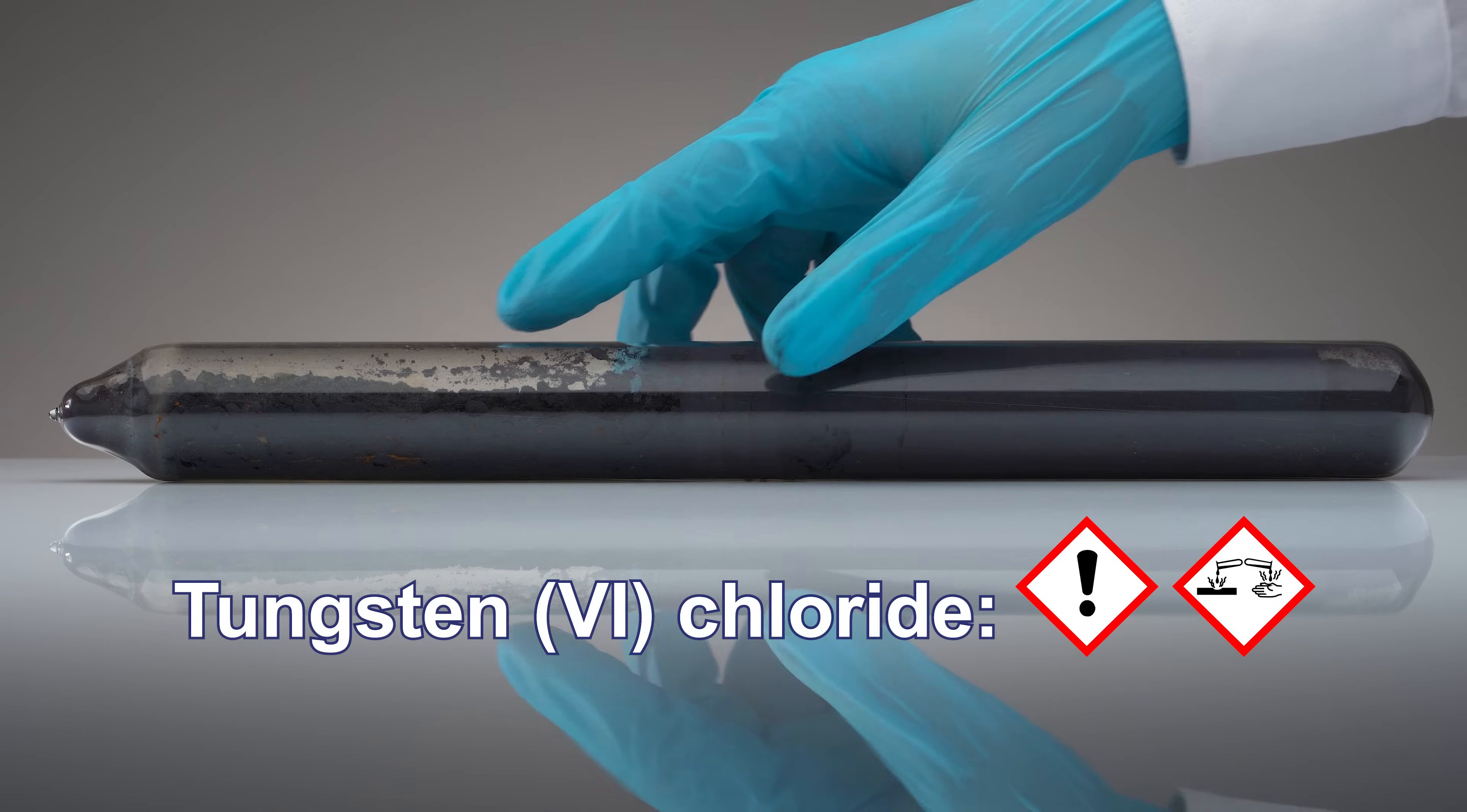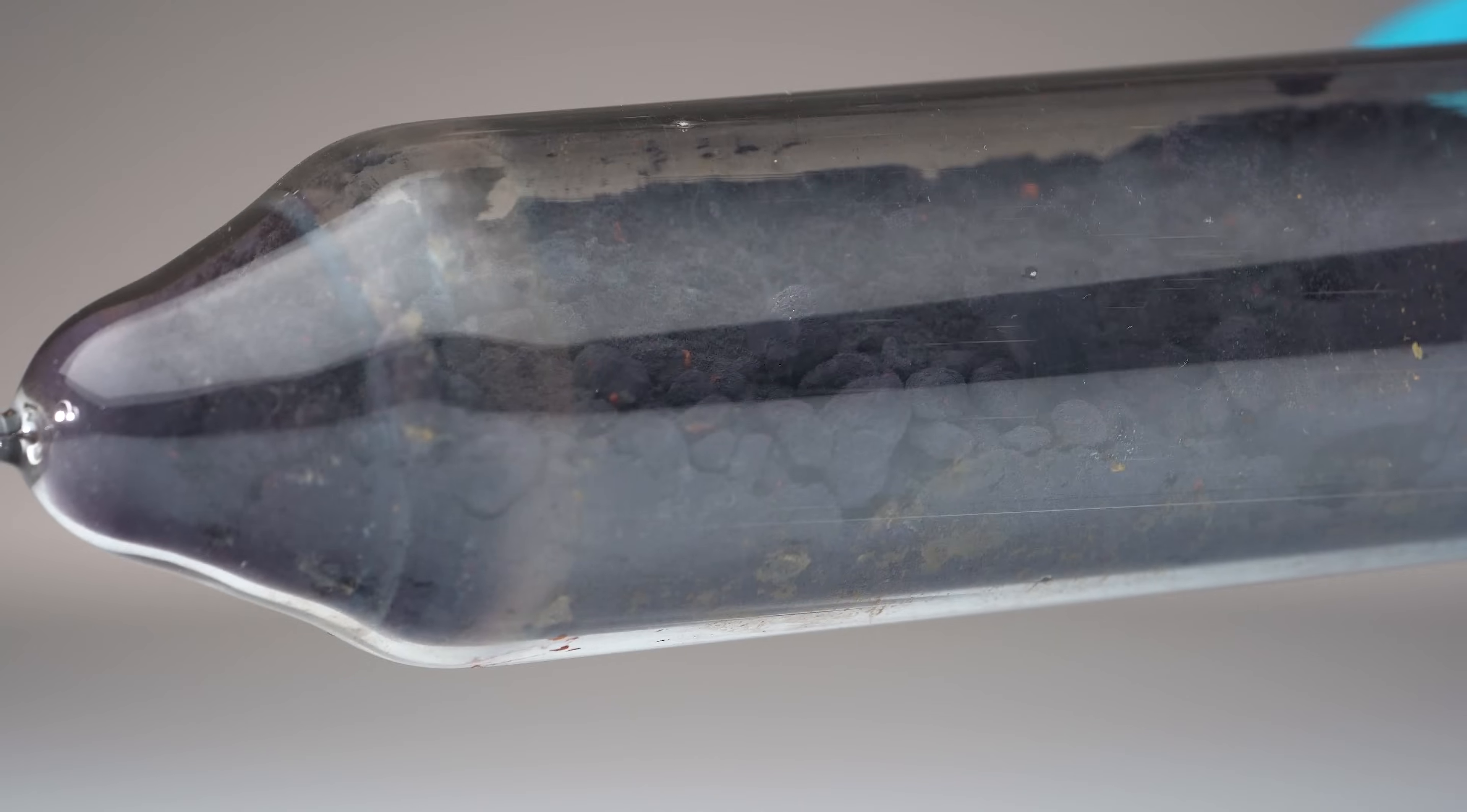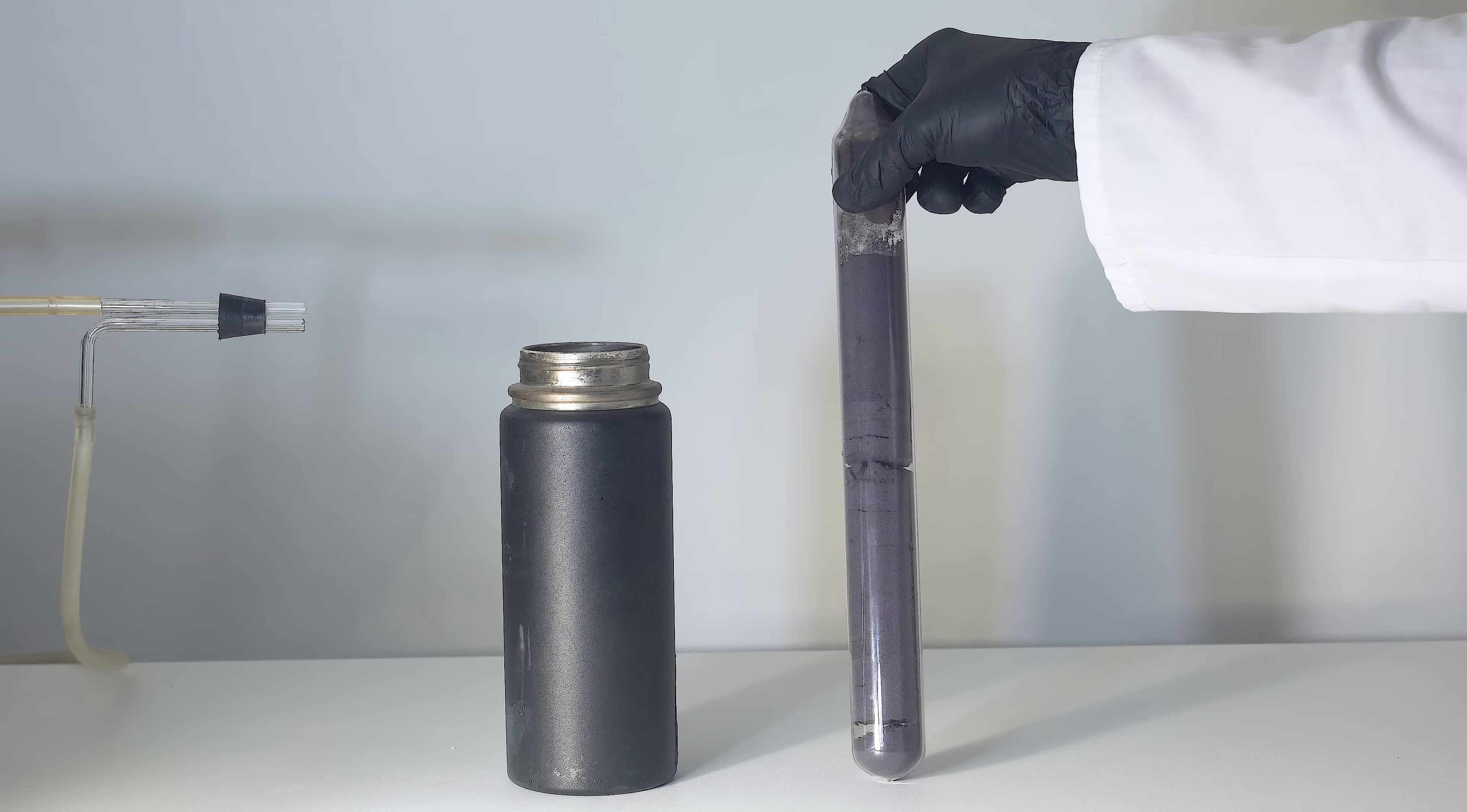This large ampoule contains tungsten hexachloride, existing as a volatile solid under standard conditions. It's an important starting reagent in the preparation of tungsten compounds. To prevent moisture from reacting with it, it's best stored in a sealed ampoule, much like other anhydrous transition metal chlorides.